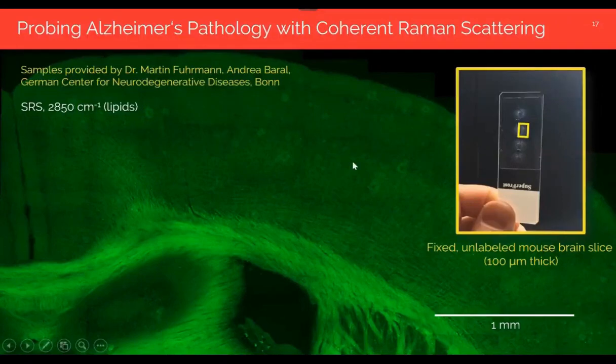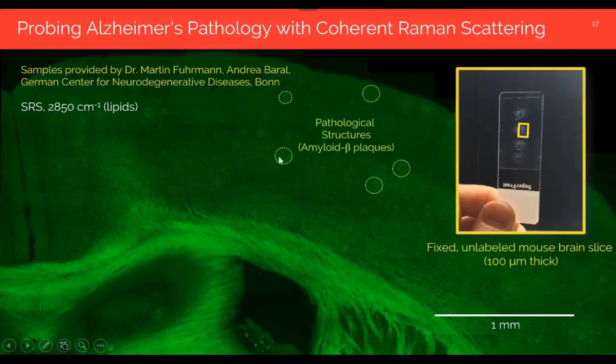You can see on top the cortex region of the brain, which is known to be composed of gray matter, which is more protein rich and less lipid rich. That's why it's dark in contrast. We can even see individual neurons on the left part of the image here projecting into those white matter bundles. We can see those little dark dots that actually correspond to the cell nuclei, to the neuronal cell nuclei.